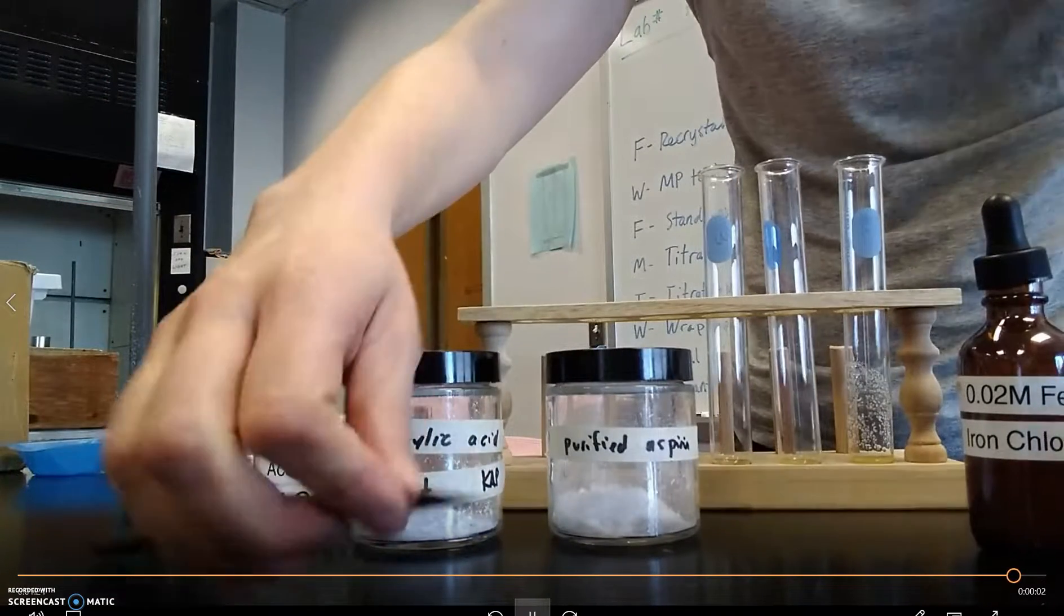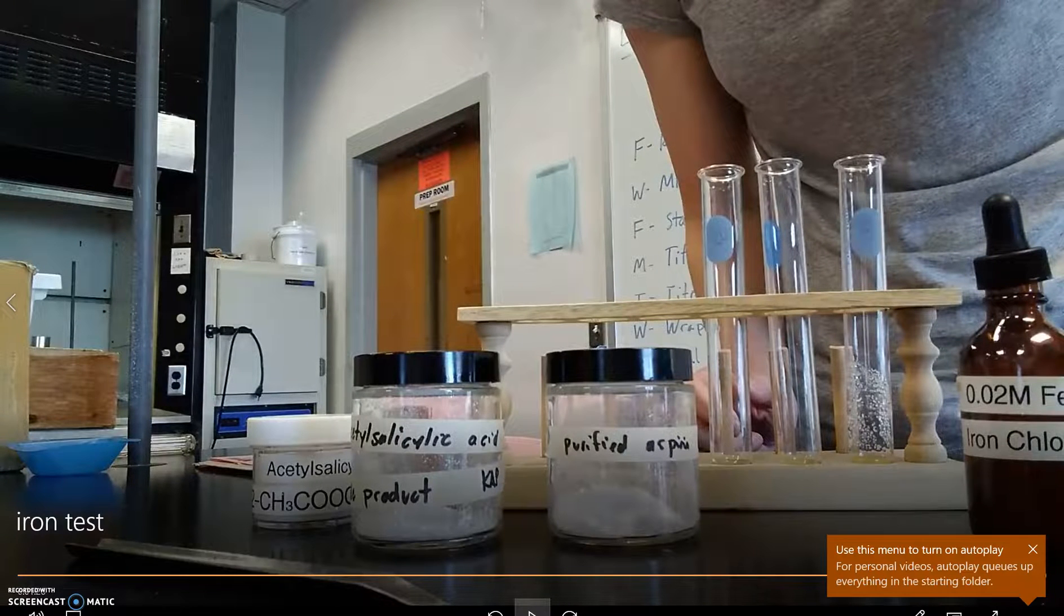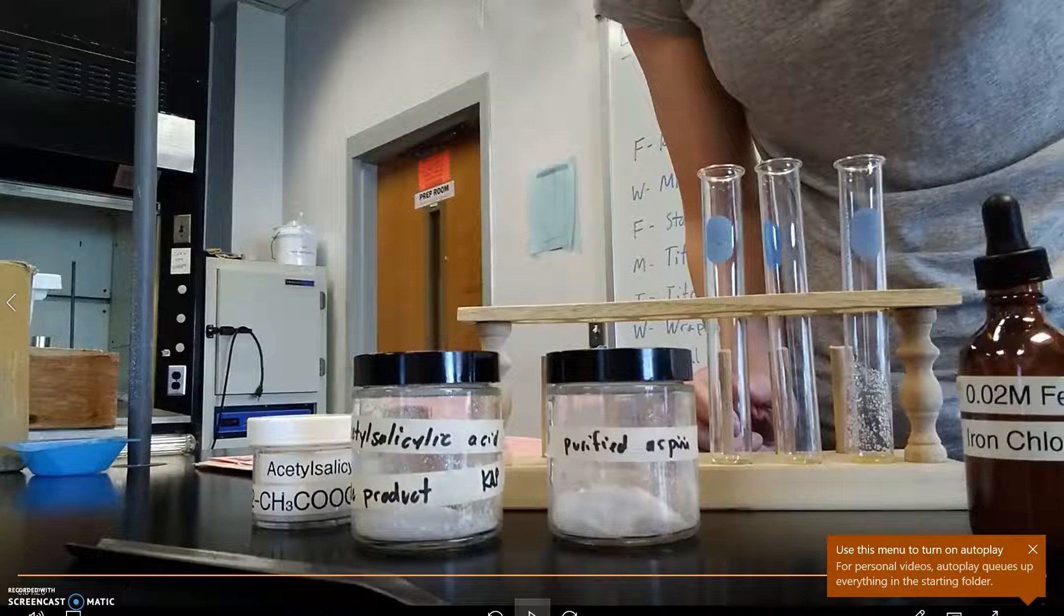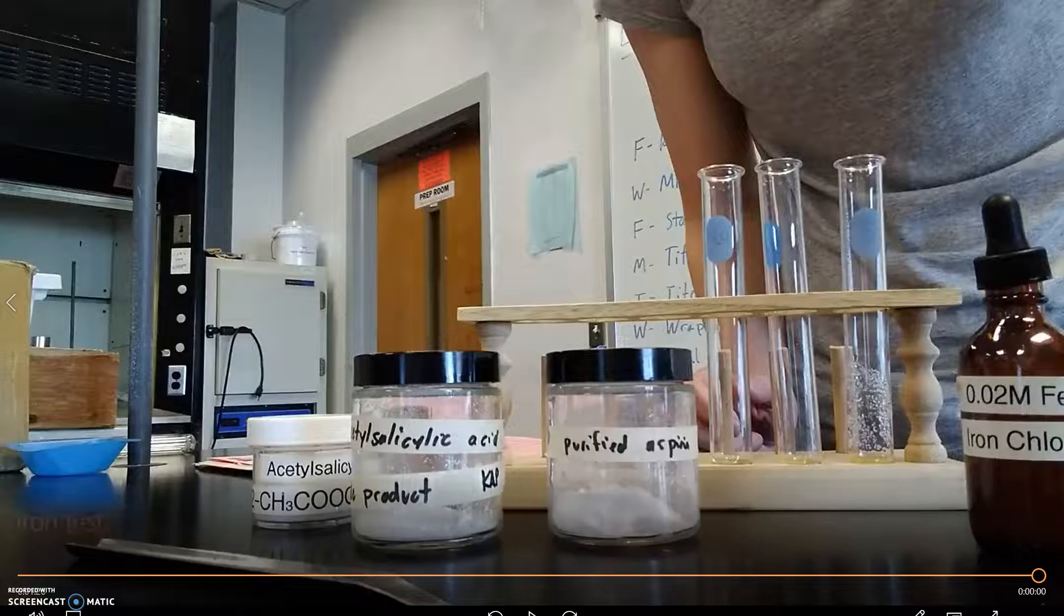You're going to repeat that same test with your purified aspirin and the crude product. Again, really small amounts, especially those of you who did not make a lot of product. And you're going to observe different colors. I don't want to ruin any surprises for you, but if it does not change color and it stays that same brownish color that it began with, that's an indication that you have a very pure product.